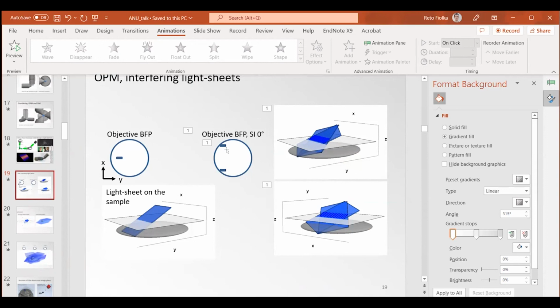This is quite hand wavy, I'm sorry, but essentially think of a beam splitter that creates two beams, and each beam is individually controlled. Maybe I can find the drawing.